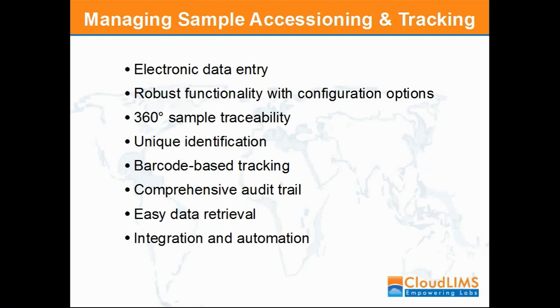Meticulous documentation is a must for testing labs throughout the sample testing procedure. Right from sample collection, LIMS allows you to automate sample and the associated data management process using distinct intuitive modules in the software. Also, the activities performed on the sample are recorded electronically.